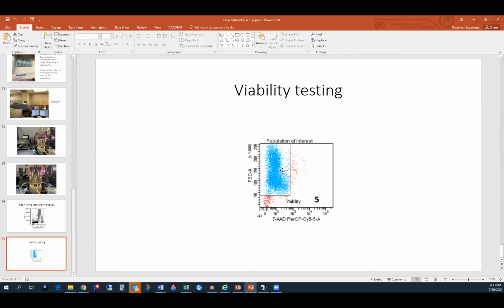It is important to eliminate these dead cells because they can stain with all kinds of antibodies and produce very non-specific reactions and a ton of false positivity. So we make sure we do it for specimens that we expect to be contaminated or expect a lot of degeneration. Okay, so now Akanksha will show you more.